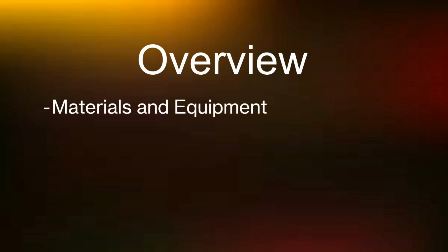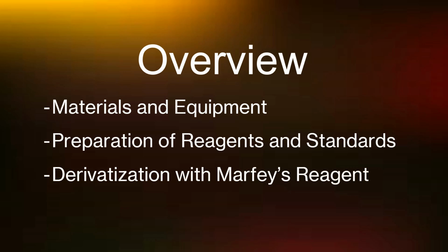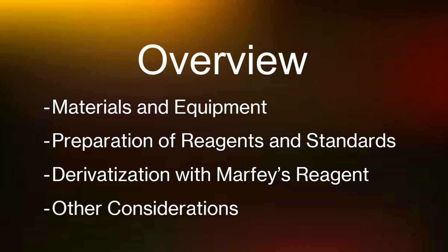To give a brief overview, this video will be covering the materials and equipment required, how to prepare the reagents, standards, and eluents we will need, the procedure for derivatizing a standard sample with Marfey's, and a few other considerations which may help smooth the process. Let's begin with what we'll need.